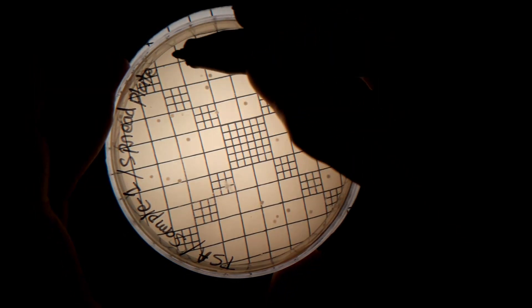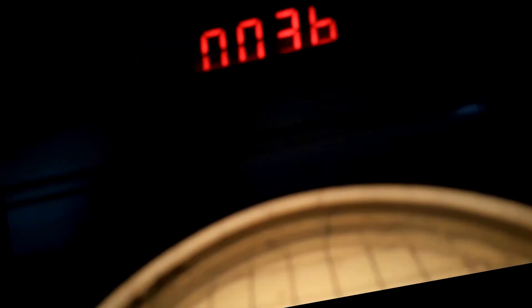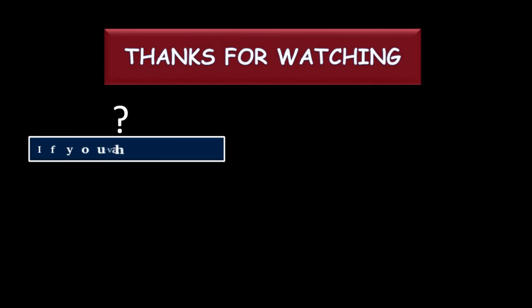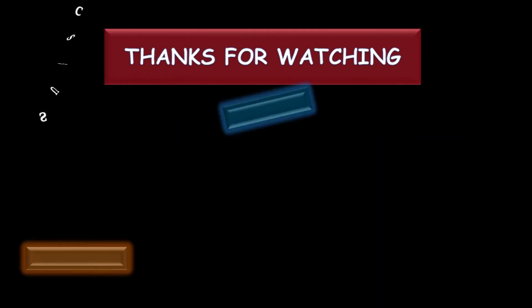We got 36 colony forming units from 0.1 milliliters of sample, so we can say the total bacterial count is 360 CFU per milliliter.